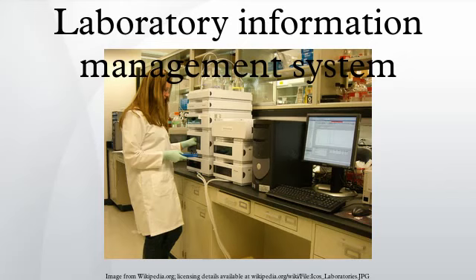Distinction between a LIMS and a LIS. Up until recently, the LIMS and Laboratory Information System have exhibited a few key differences, making them noticeably separate entities. A LIMS traditionally has been designed to process and report data related to batches of samples from biology labs, water treatment facilities, drug trials, and other entities that handle complex batches of data. A LIS has been designed primarily for processing and reporting data related to individual patients in a clinical setting.